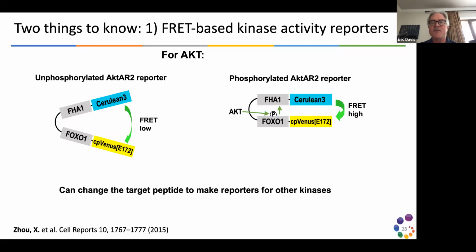And this is very useful as compared to other ways of measuring kinase activity. You can see that there's a modular design to this reporter. If we change the target peptide to be specific for a different kinase, then we can have a reporter for another kinase.